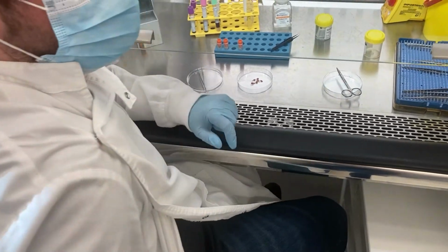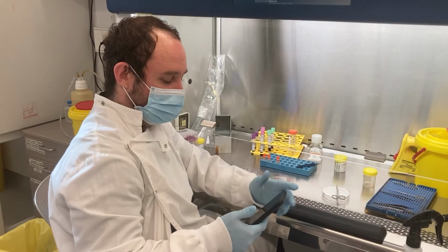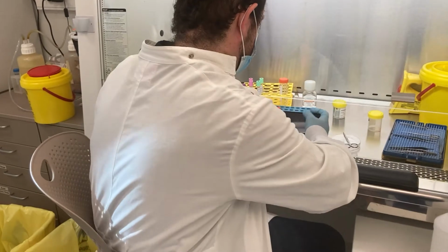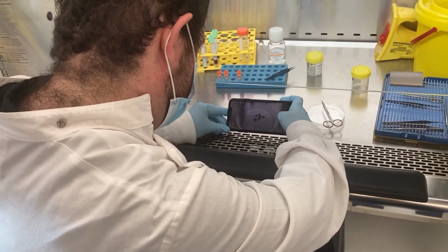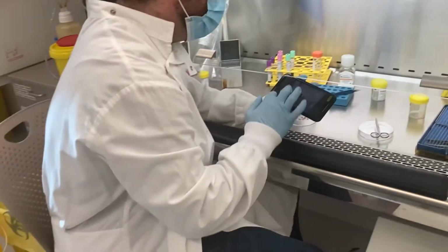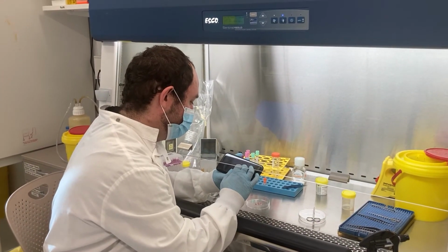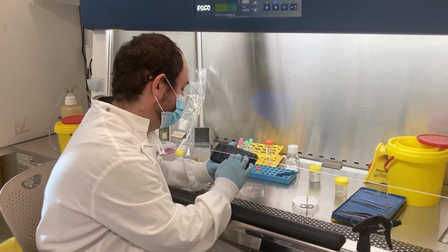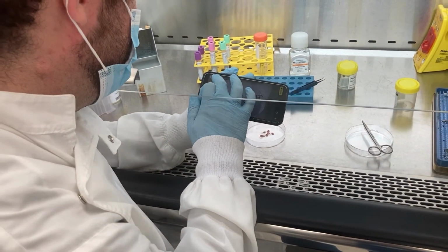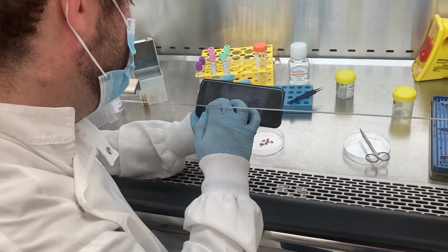Now, a little bit different to other research teams, we actually use Snapchat as a way to help us profile the patient's tumour. So what I'll do is take a photo. I'll save the image, and then I'll annotate it using Snapchat. And that's a way I can say, well, this part is going to go to fresh frozen, FF is our code. I might change the color. This part will go to more histo.